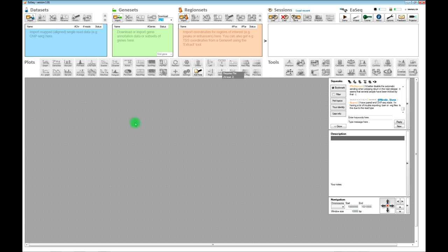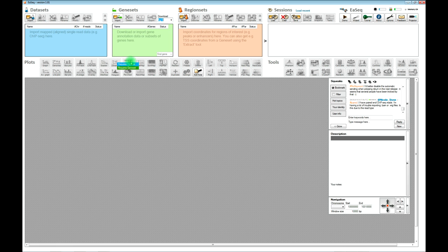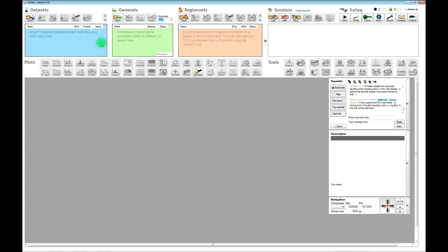We have some tools controlling the plots, and as you can see, most of them are inactivated — they will require you to import some data. They suggest which type of data you need before you can use them. We also have some analysis tools here that will also tell you what type of data they need to become activated. So as we import different data into EASEQ, you will see these icons becoming available.